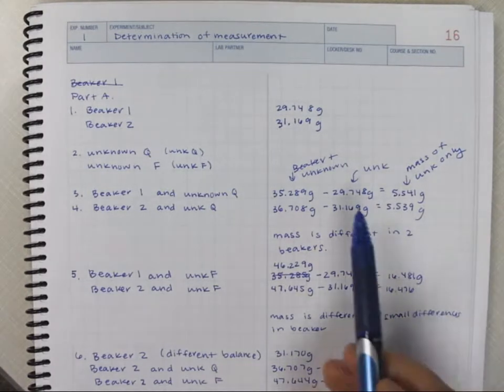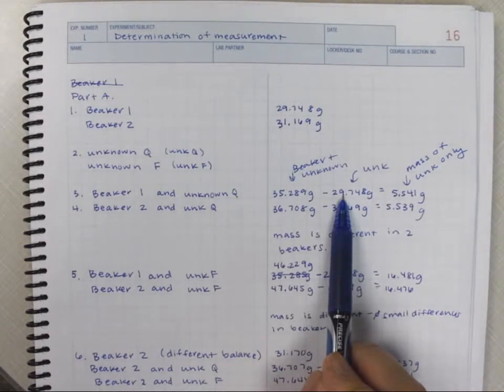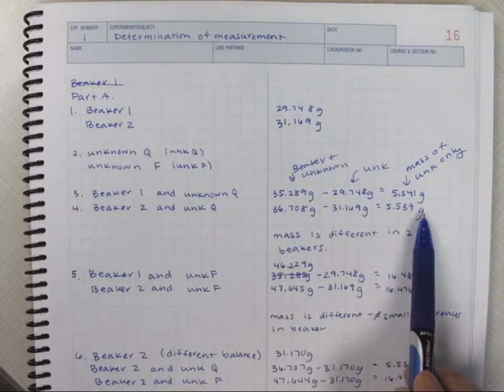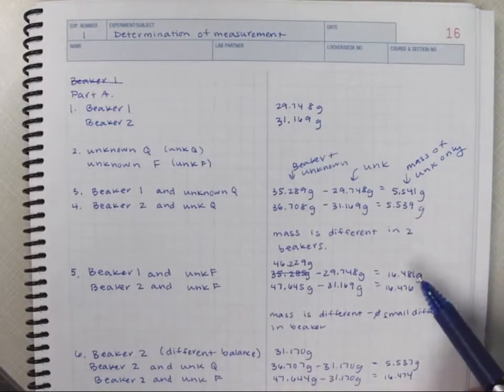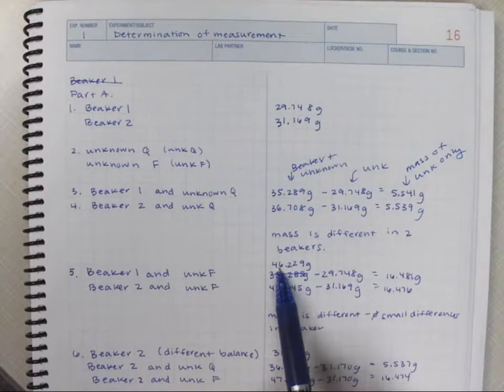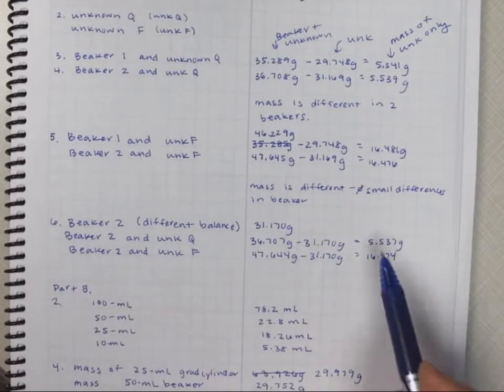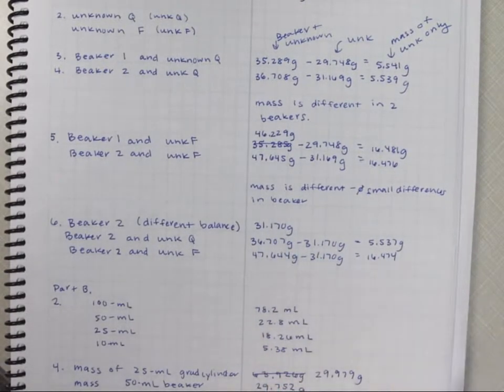You would subtract the combination of the two and then subtract the mass of the beaker to get 5.5 for 1. And this is measuring it with the second beaker, so notice that the masses are slightly different. The other thing is the same for the second object. You'd have the combination of the mass of the beaker plus the unknown and then subtract the mass of the beaker. And then you do the same thing for a different balance. Notice that the values again are slightly different.